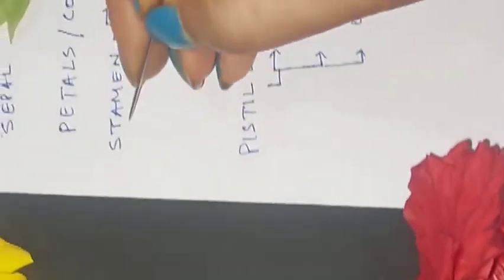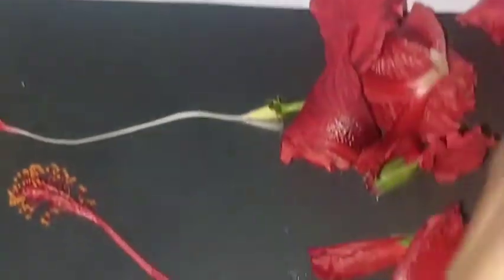This is the male part of the flower. Now let's move to the next part. Here I have just removed the filament and the anther. You can see it has powdery substance inside and it is covered with pollen so that it can go further for the fertilization.